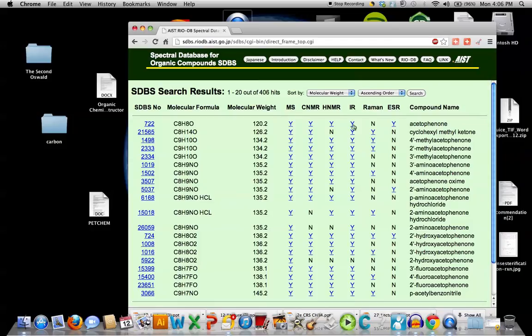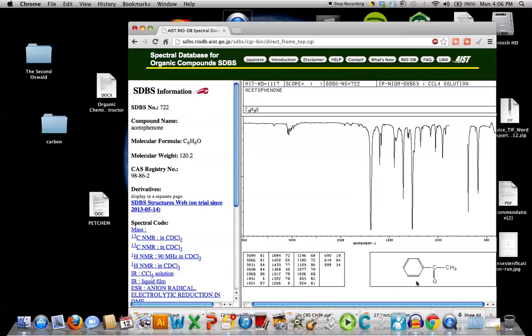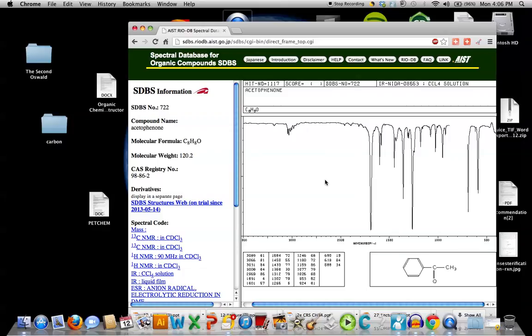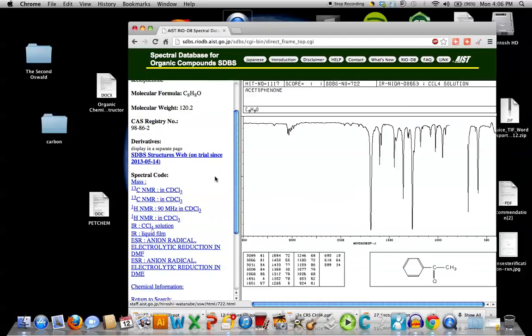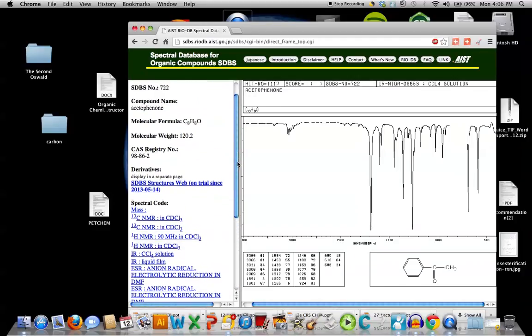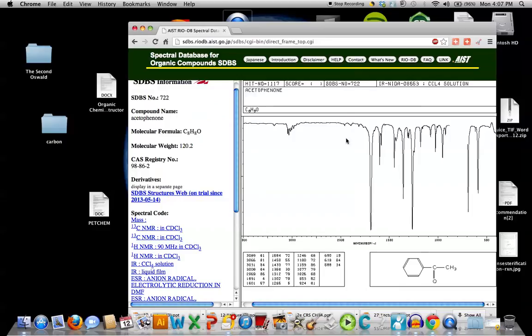First thing I want to call your attention to is the infrared by clicking on that. And then you will see what the infrared looks like. The spectrum for acetophenone structure in the lower right. The principal bands that are showing up in the infrared. We're running from 4,000 down to around 500. You can usually expand that by clicking on it. In this particular case, it's a no-show. But the infrared can be shown to you. And there's your powerful carbonyl stretch. You have absorption to the left and right of 3,000 because of the aromatic hydrogens, the vinyl hydrogens, as well as the methyl aliphatic hydrogens. So you're to the left and right of 3,000. There's the overtone region, which can be interpreted. And also the fingerprint region. And the carbon stretch right around 1550s, 1600 reciprocal centimeters. There's the carbonyl ketone stretch. Very pronounced.